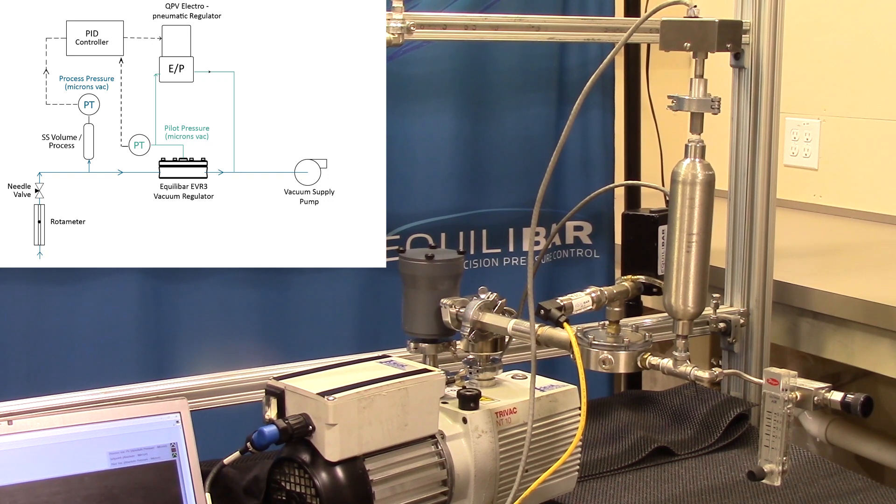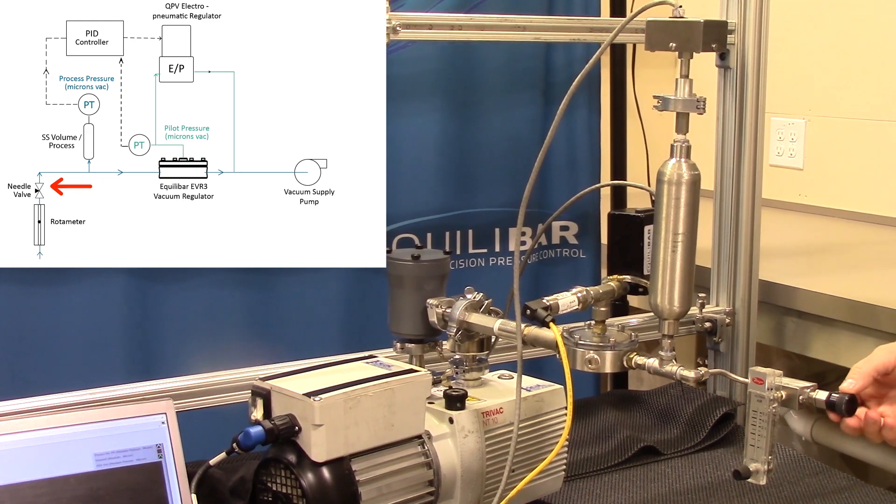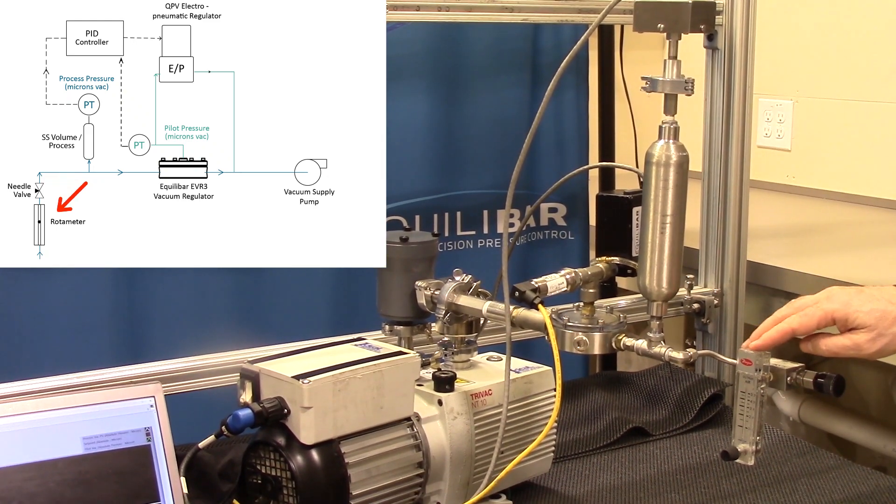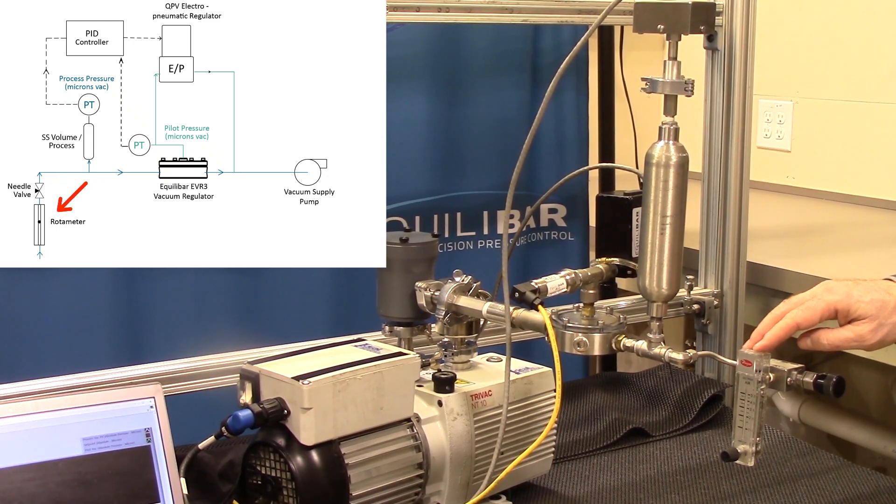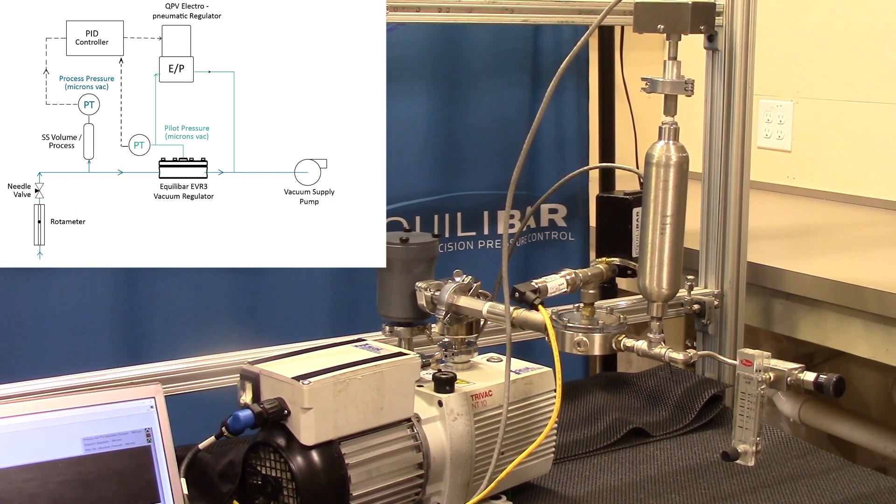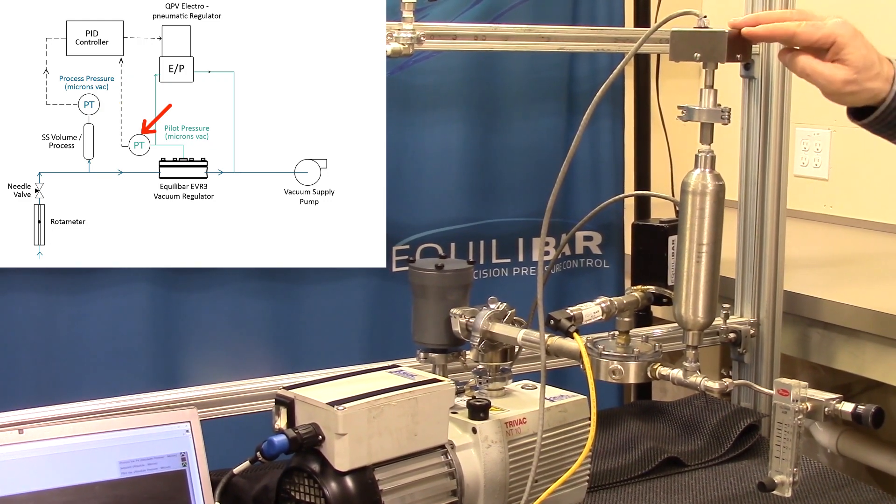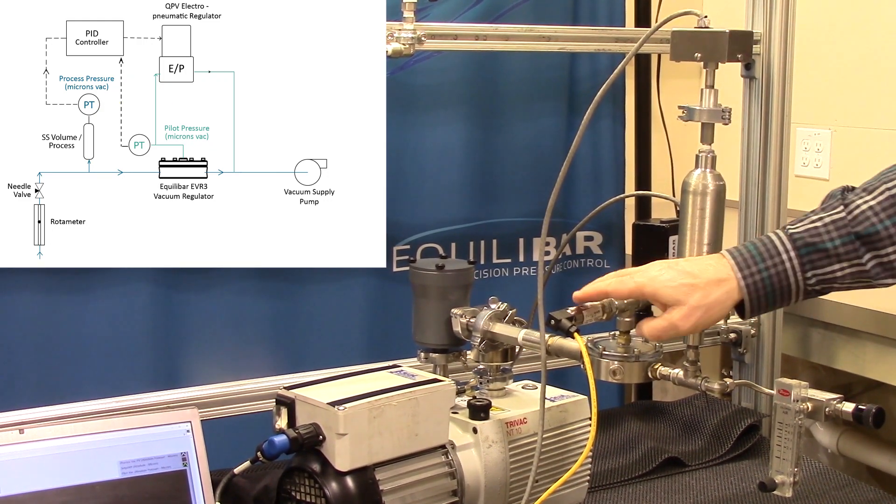The customer's process is simulated by this stainless steel volume. A needle valve with a small rotometer allows us to vary the mass flow going into the process. This rotometer is ranged 0 to 50 standard milliliters per minute. Both the process and pilot pressures are monitored by absolute pressure sensors reading in micron.